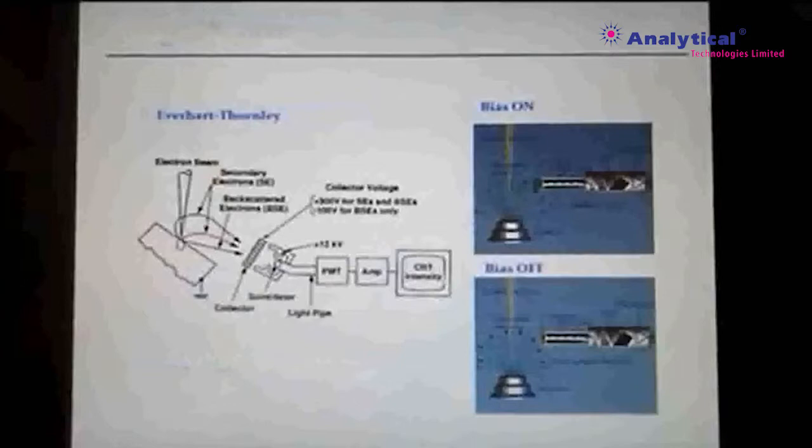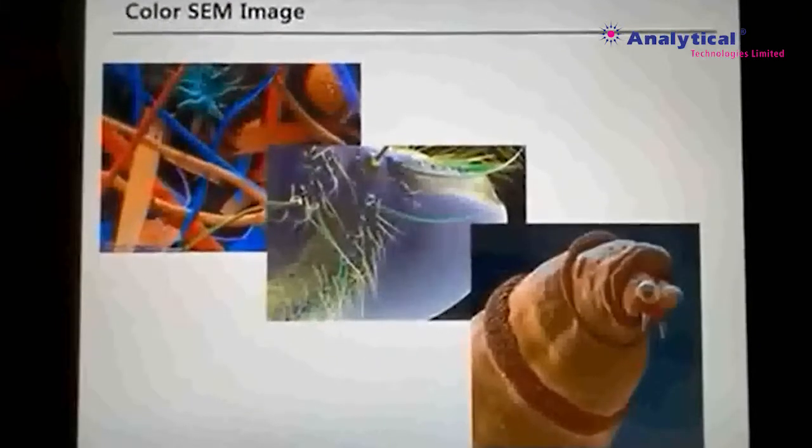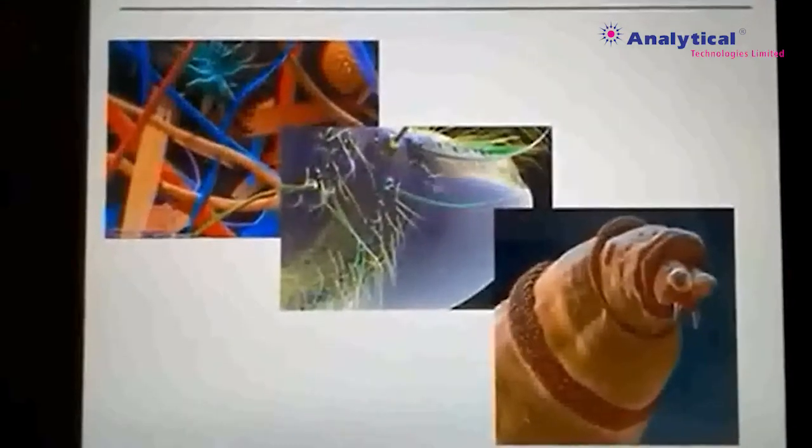This electron signal will change to light signal through the detector, and the light signal will again be amplified to change to electric signal. Thus, such signal's quantity and brightness will determine the black, white, and gray level on the screen. If you have seen a colored electron microscope picture, its image has been post-modified. By using the Photoshop's gradation function, we can easily make the image colorful.